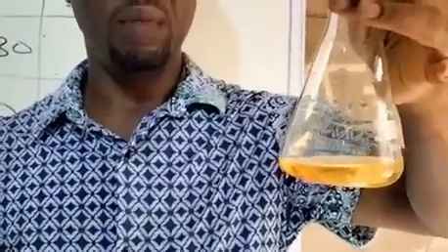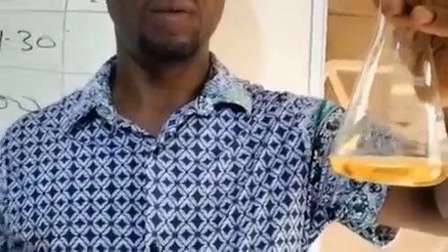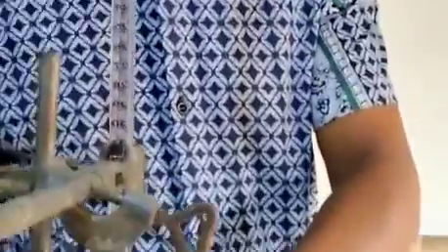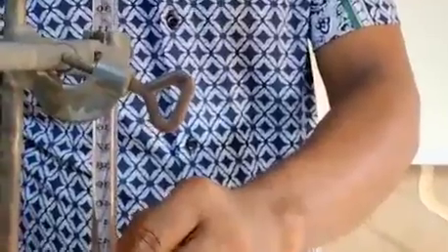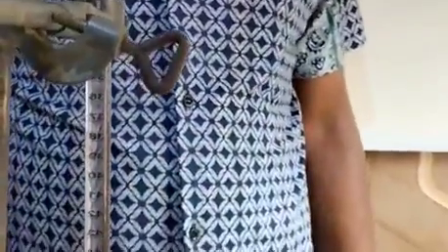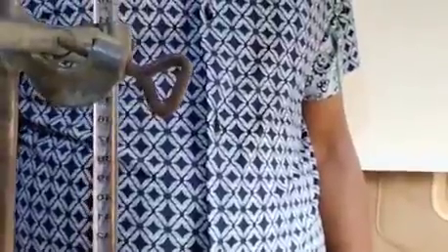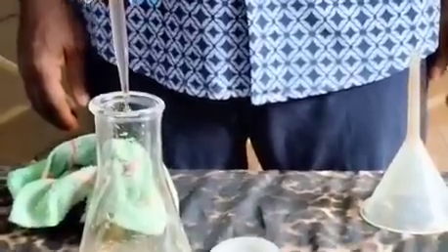So we're going to start the experiment now. Open the tap. Remember the initial is 10. So open the tap and allow the acid to run into the alkali. As we remember, we said we are moving to 30. Then we can increase the tap rate. It's going faster. Once it reaches 30, we'll close the tap and take it slowly. So you can see that.